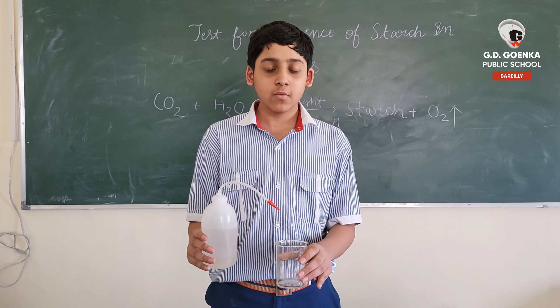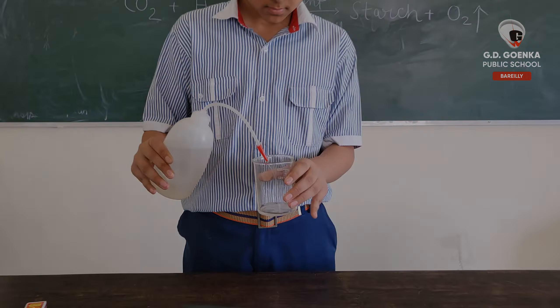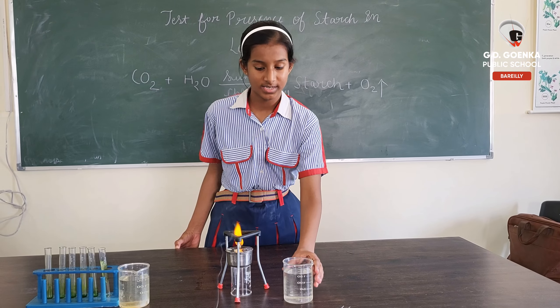With the beaker, we pour the water. Then, we will place the beaker on the tripod stand.